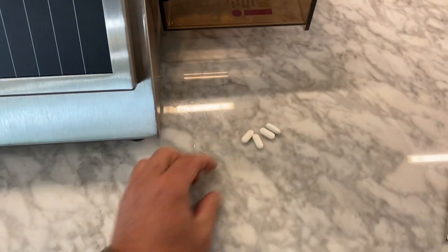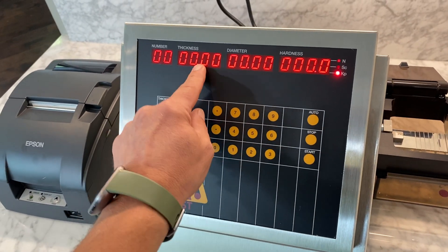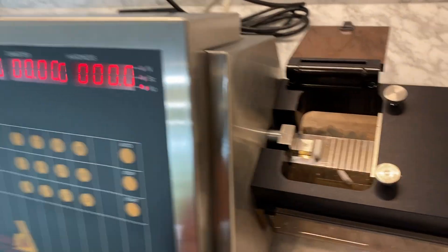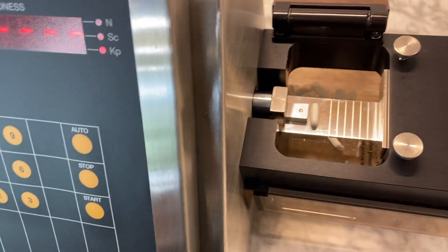In this example, we'll be testing an oblong tablet. You would first enter in the nominal values — your target values — for the thickness, diameter, and hardness. Once that's been entered, we place the tablet on its side up against the test jaw, press start, and you could enter in a lot number, and the jaw will come out.